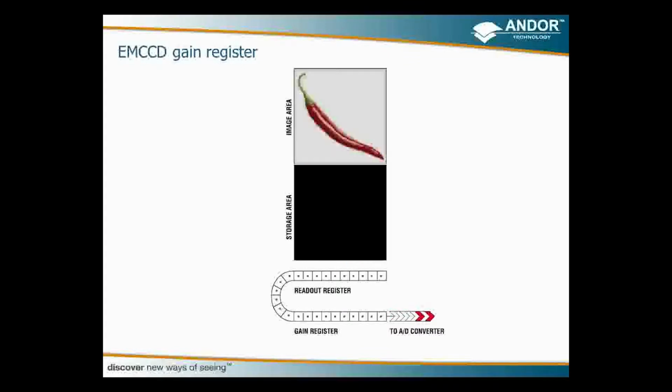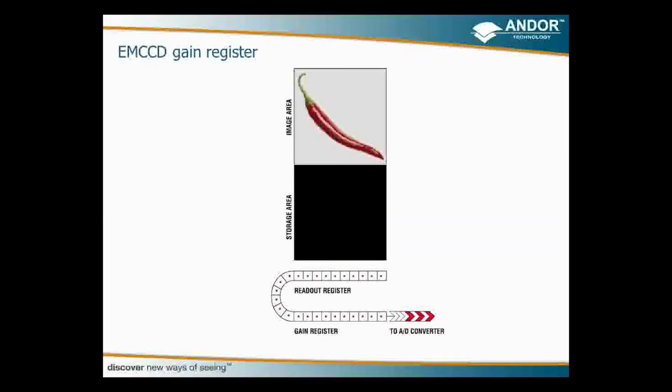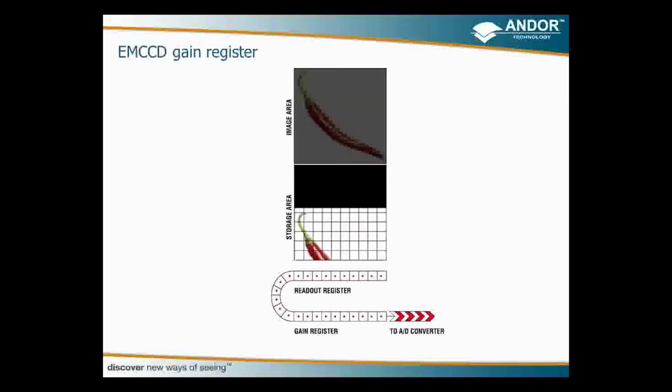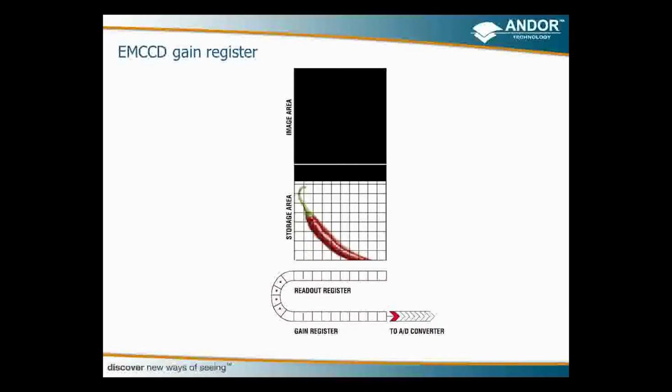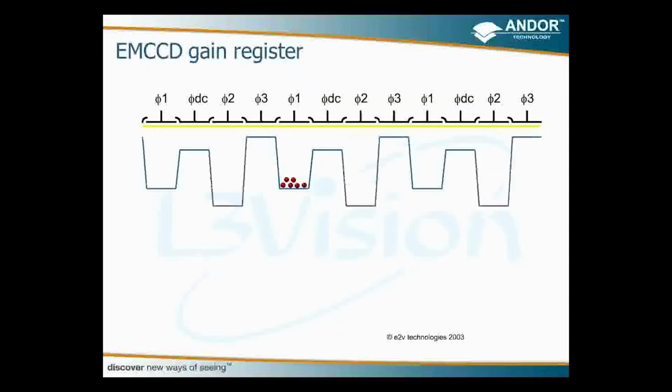This is a very simple animation, and what it's really trying to point out is the architecture of most EMCCDs. In fact, every commercial EMCCD on the market pretty much has this architecture of a frame transfer sensor, where you would expose the image, rapidly shift under the mask, and while you're reading out, another image builds up in the open exposed area. But really the unique part of the EMCCD is this insertion called the gain register. As every pixel is read out, it travels through the pixels of the gain register, and that's where the amplification process takes place.